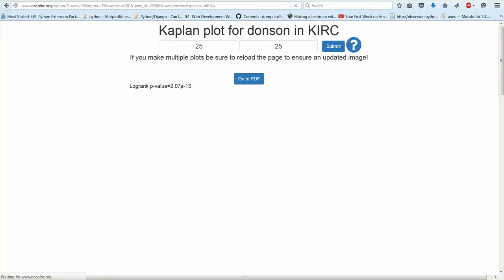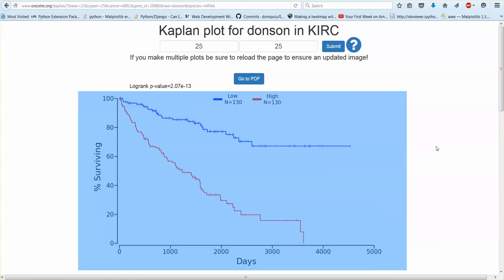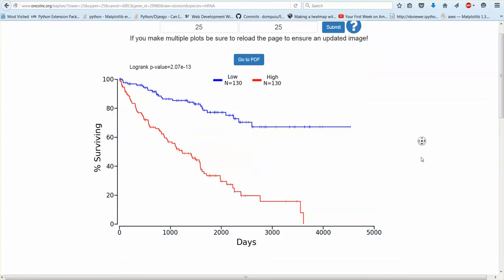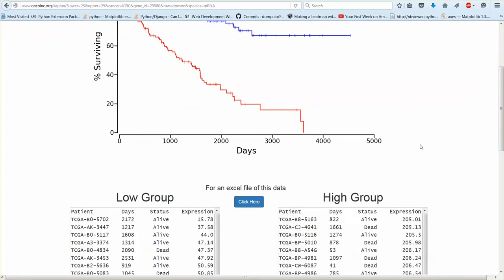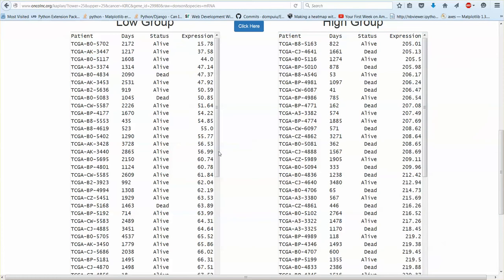You'll get a log rank p-value which is calculated very quickly. Sometimes the Kaplan plot will take some time to generate. And then below the Kaplan plot you'll get the data that was plotted.